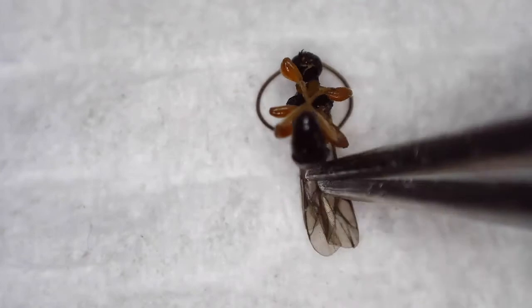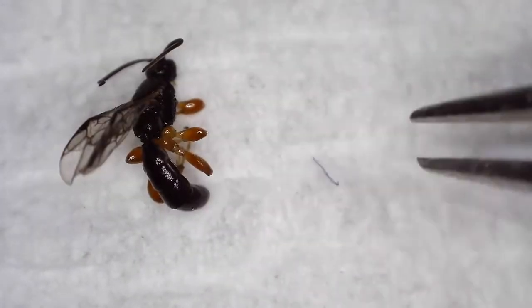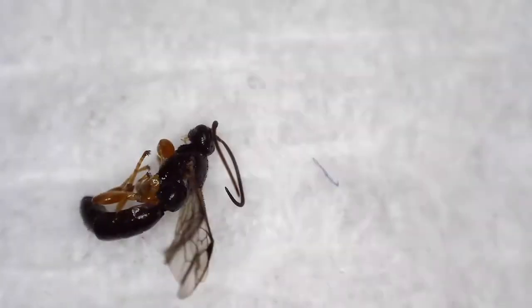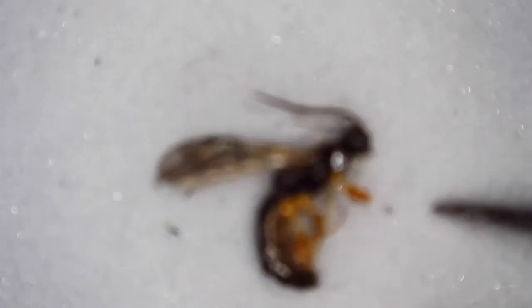Our next insect is actually a Hymenoptera, or a wasp, bee or ant. This is specifically a wasp. And this wasp is on the small side. It is maybe half a centimeter long, so I won't be able to pin it, but instead I'm going to show you some point mounting.